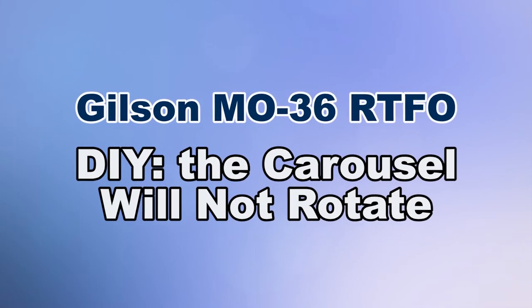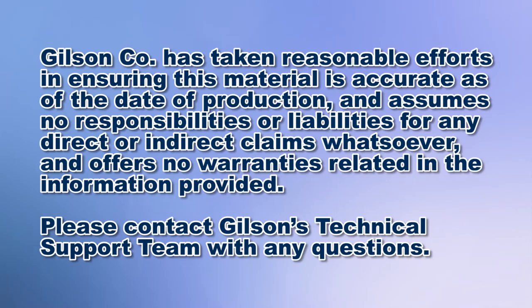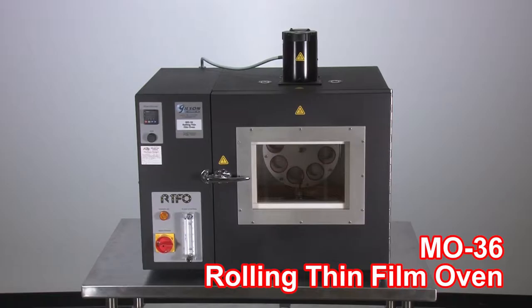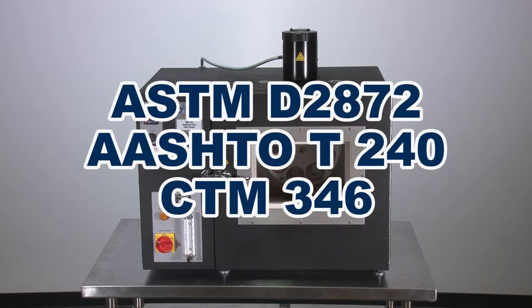The Gilson Rolling Thin Film Oven features advanced design, durable construction, and repeatable accuracy in measuring the effects of heat on asphalt binder specimens, in accordance with ASTM and AASHTO test specifications.